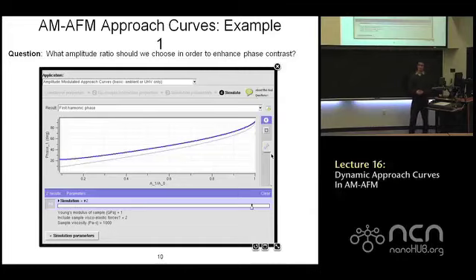Okay, so if you ran these two simulations, for two separate approach curves, we can choose to select display all, and go to the first harmonic phase versus amplitude ratio. What this is showing us is the deviation between these two lines. The first simulation was for a conservative interaction, and the phase will follow the arcsine of the amplitude ratio.